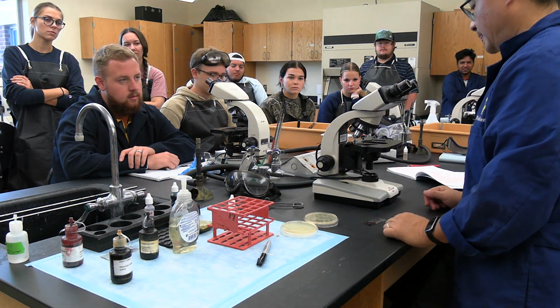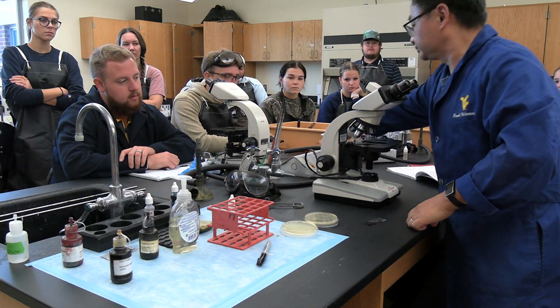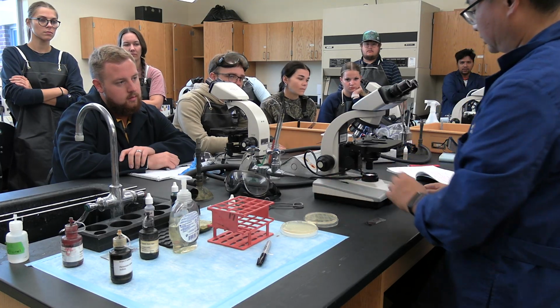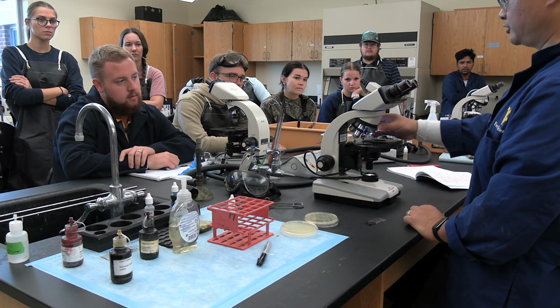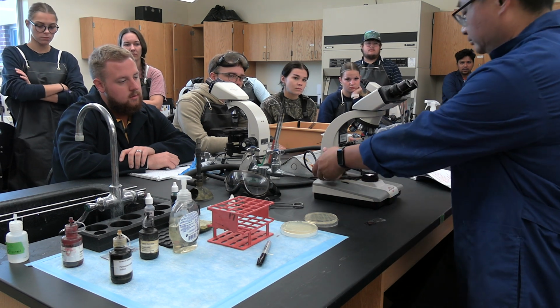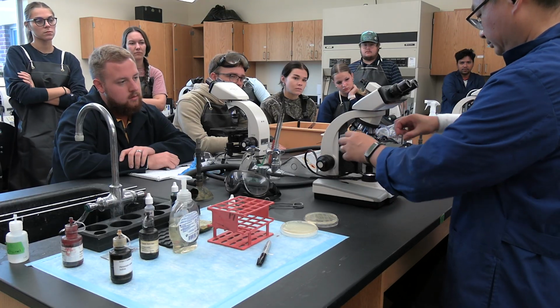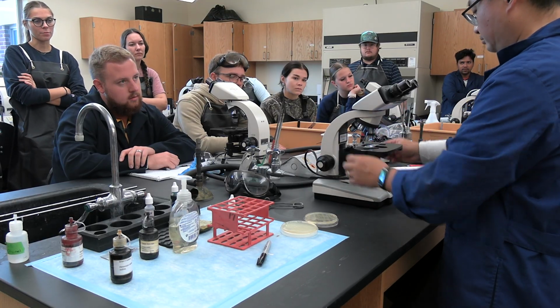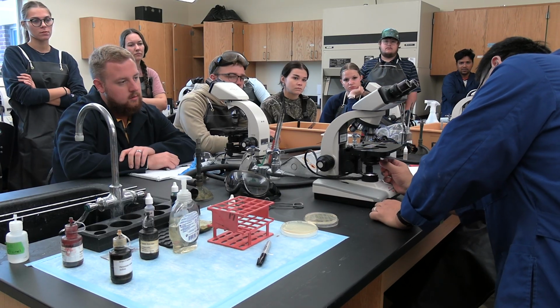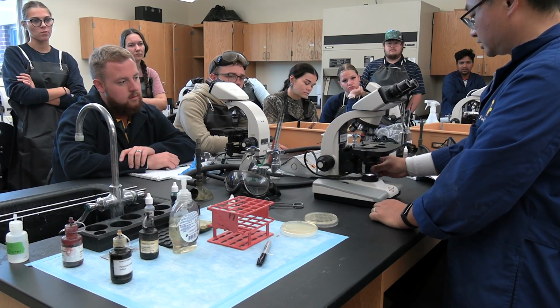So we'll see. Okay, again, we're going to practice using the microscope. First things first, plug in, turn it on, and this is wrong. You never use 4x. Some people use it, but that's an obvious mistake. So we're going to pull down and put the microscope slide in. And then we adjust the iris diaphragm at 10x. Make sure it is working very well.